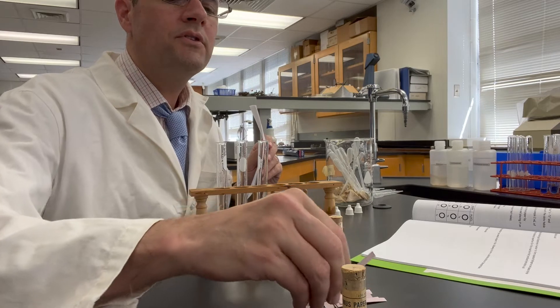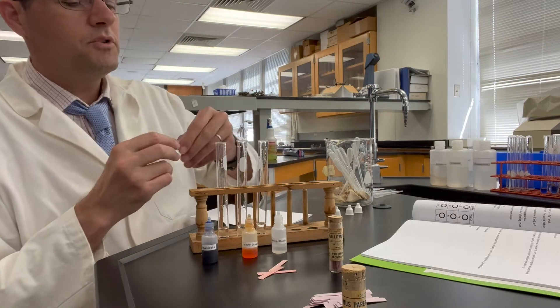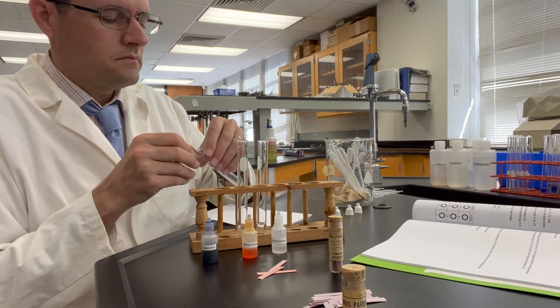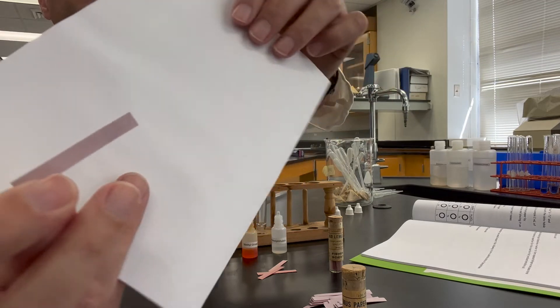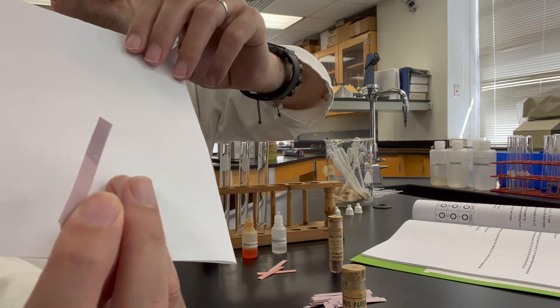Blue litmus paper starts out with that little bluish color there. We'll dip this into the sodium acetate solution. And that's the color of sodium acetate in blue litmus paper.